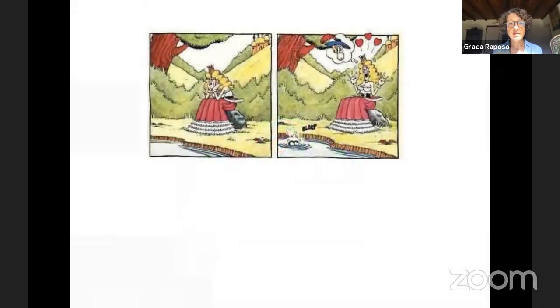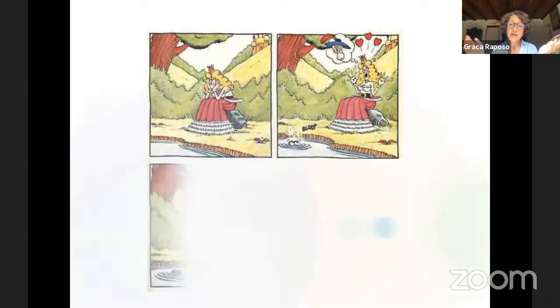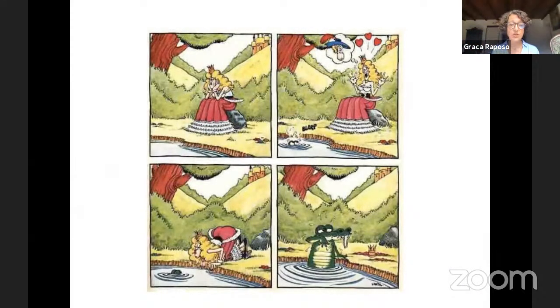And to the end, of course, it is a marvelous technique, electron microscopy. You just have to be aware of the artifacts, as I told you. When we use chemical fixation, we know that we have limitations, we know that we have artifacts, and of course, you can always be eaten by the crocodile.